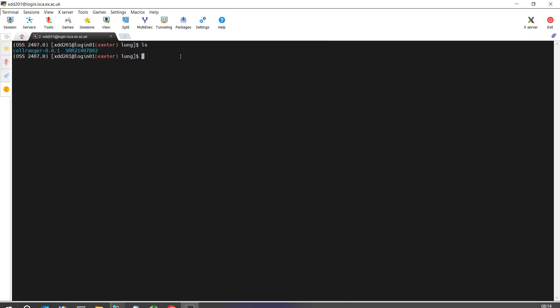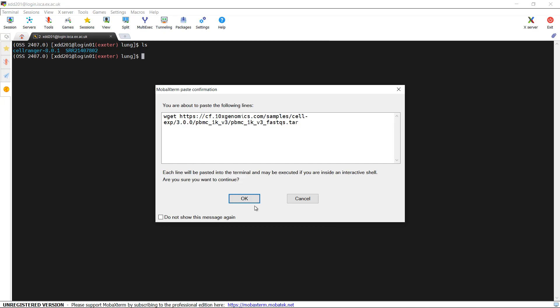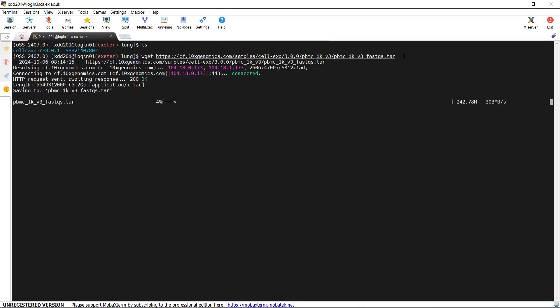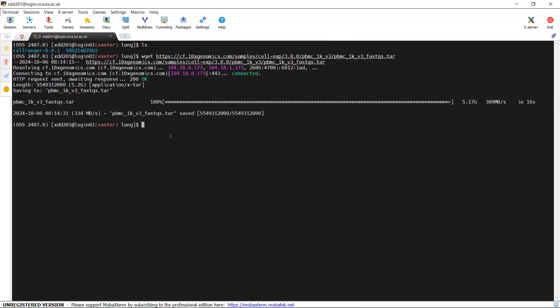We can paste it here and now download the data. You can see it is downloading — it is very quick. We downloaded the raw sequencing data for the 1K PBMC dataset. Let's have a look at the files using the ls function. You can see we now have a file named pbmc1kv3 fastq file.